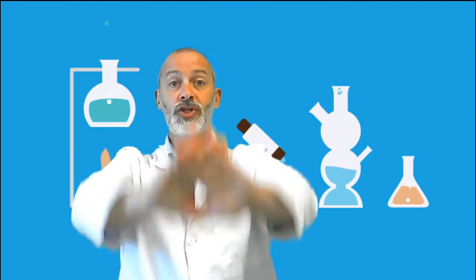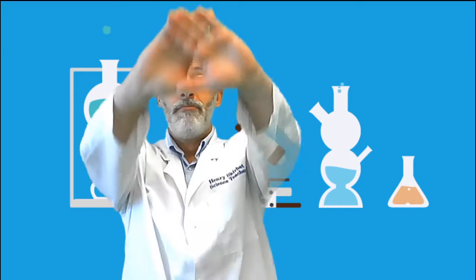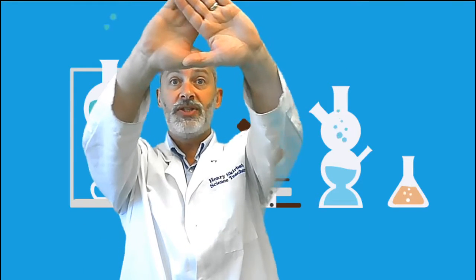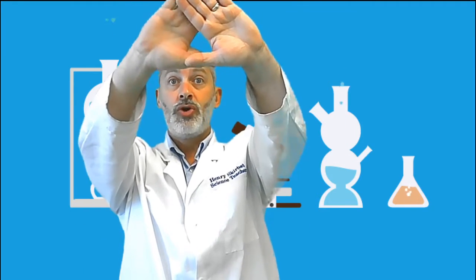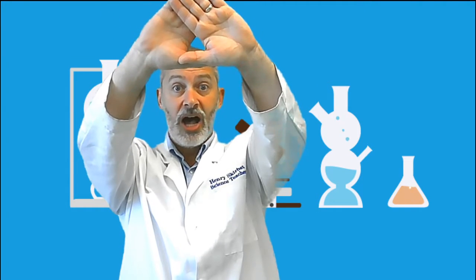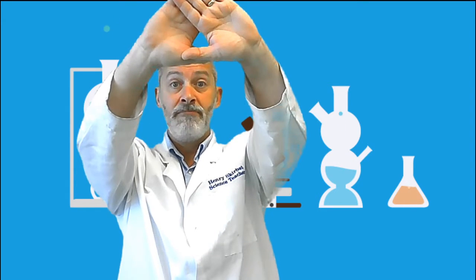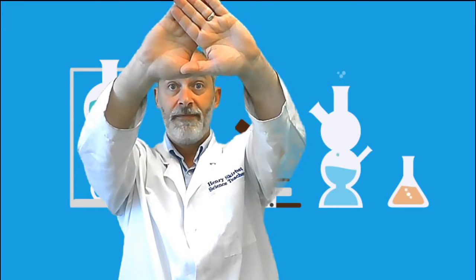Move your hands with both eyes open. Move your hands and adjust the triangle so the triangle is touching the edges of the clock with both eyes open. You want to see the clock in the middle of that triangle.